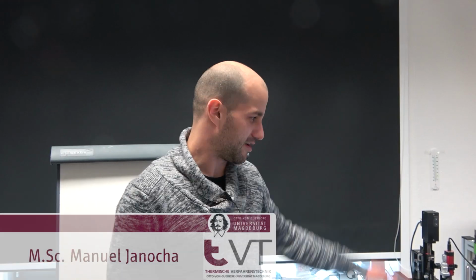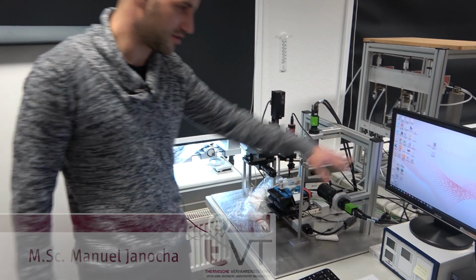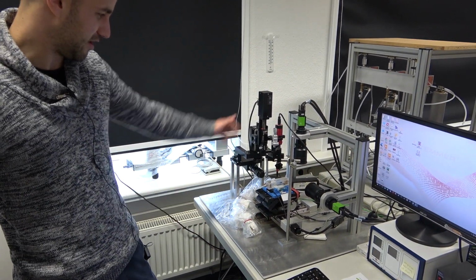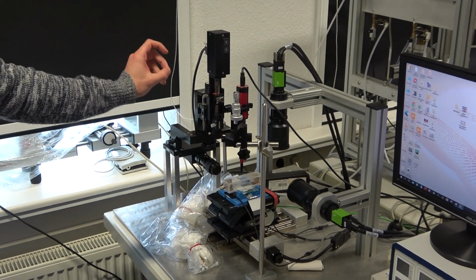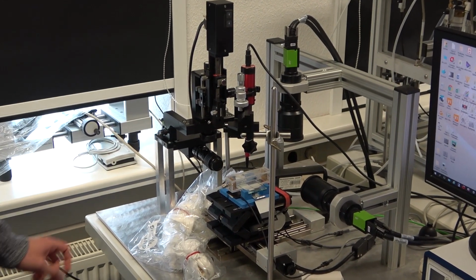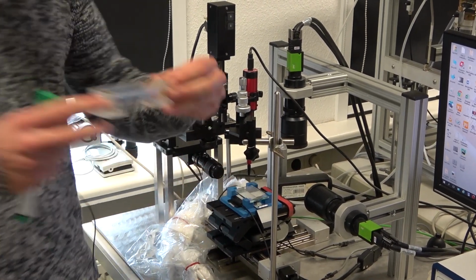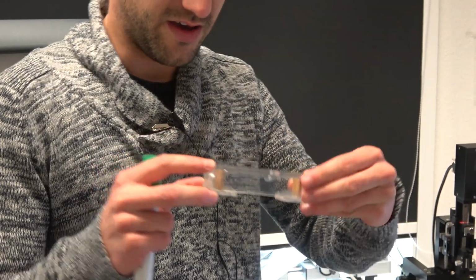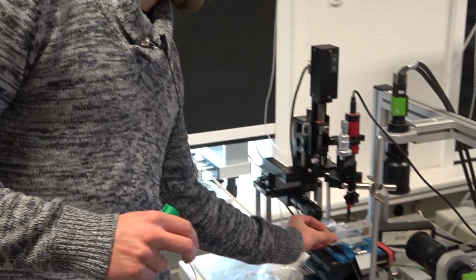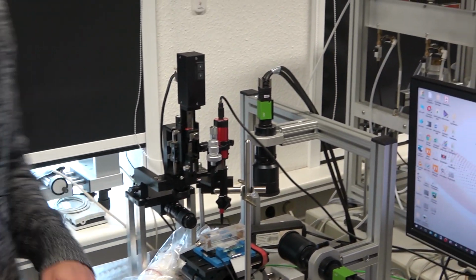Yeah, this is our sessile droplet drying setup. We have multiple cameras here to watch droplets drying, and we have a nanoliter dispenser with which we can apply droplets on different substrates. And we do this in this kind of small drying chamber where we can apply different convective conditions to the droplets, realized with this air supply.